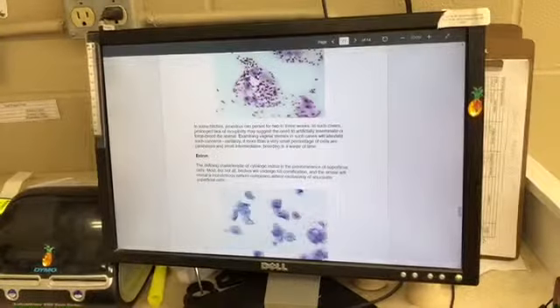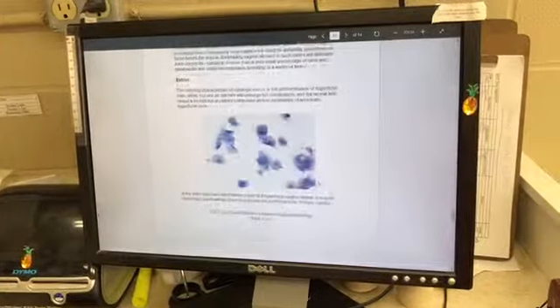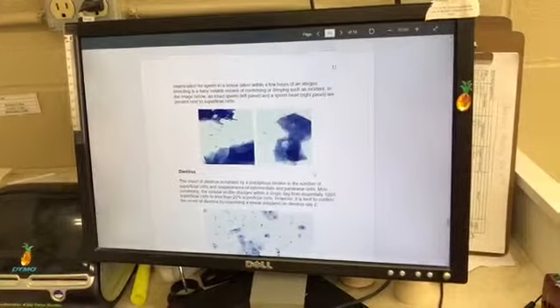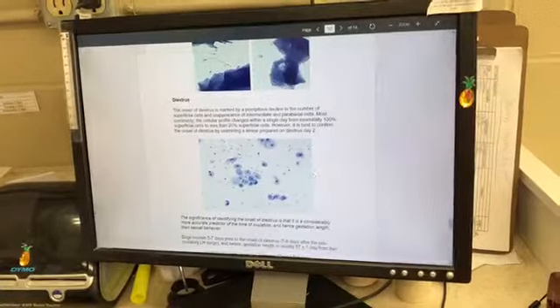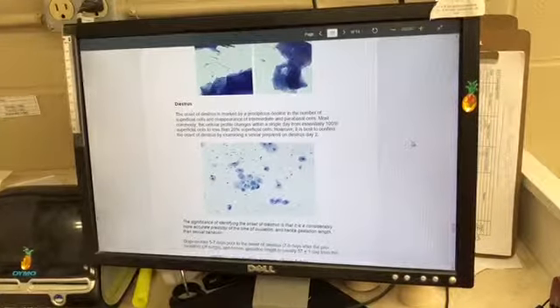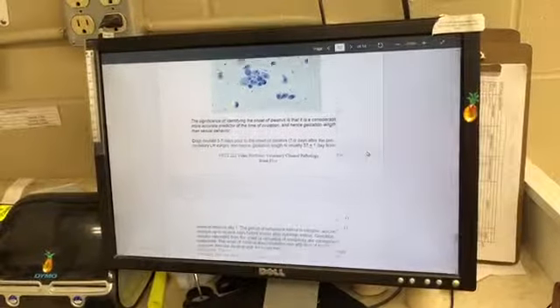Moving on to the estrous stage, you'll see superficial cells predominating. And then in the diestrous stage, you'll see a decline in the number of superficial cells and a reappearance of intermediate and parabasal cells. And that completes the vaginal smear.